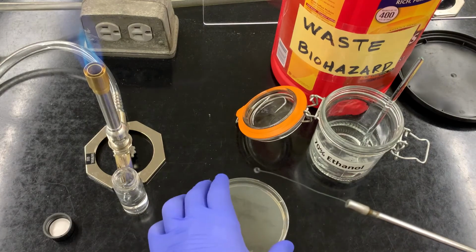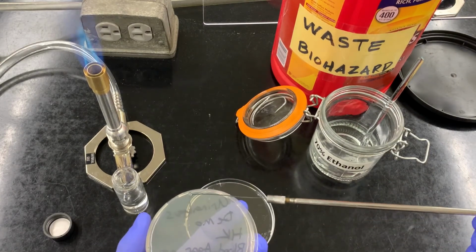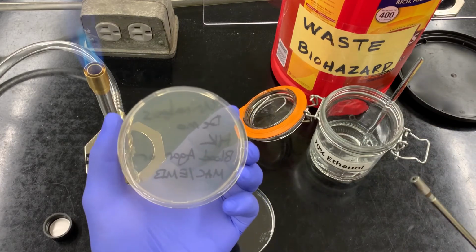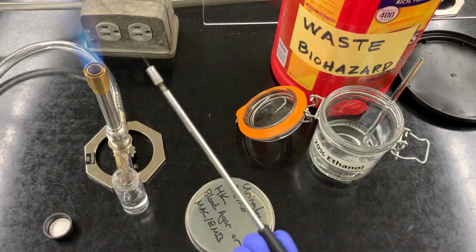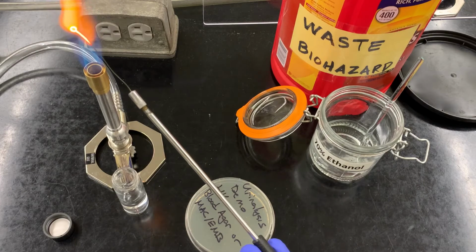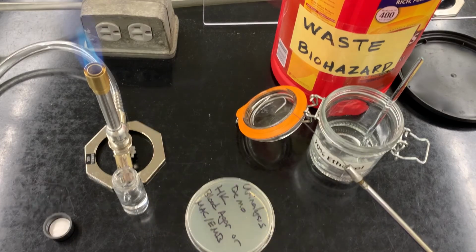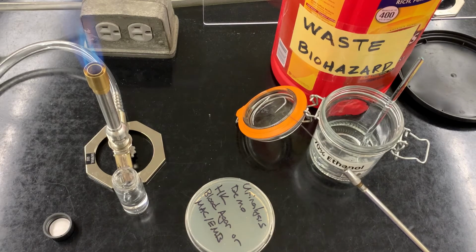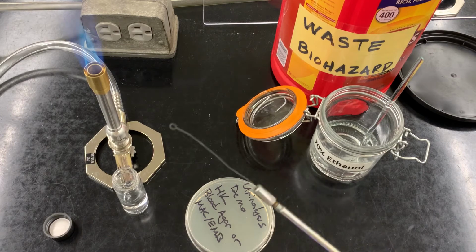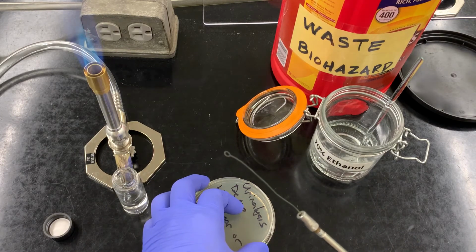Grab our urine sample, and this time, put it down, we are going to go top to bottom. I'll show you that. I guess bottom to top, just like that. And that's our inoculation. Now we're going to sterilize our loop, right? So now we have placed 10 microliters of our urine sample onto the plate.